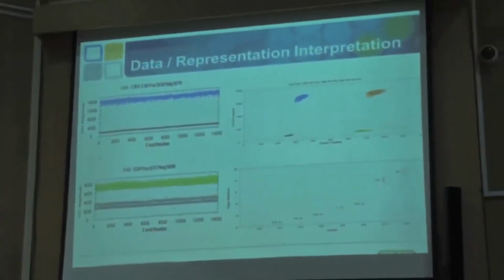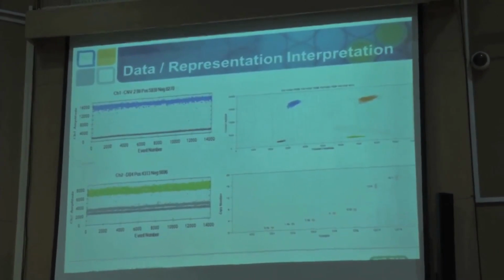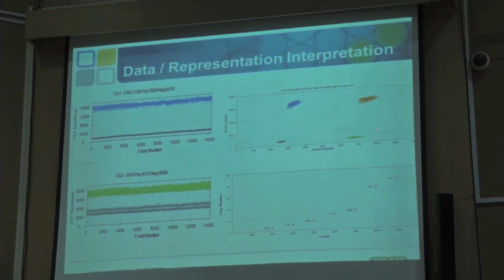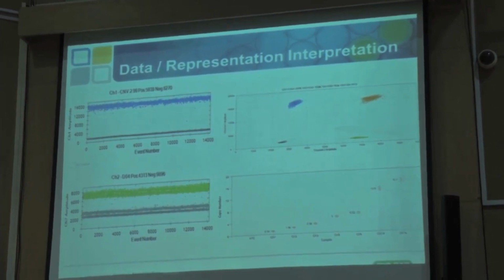Now this cluster which you see is from one type of amplicon. If another amplicon is smaller or bigger than that, that would give a different layer here. You can quantify each of these clusters individually. For example, in 2D you get it here, so you will have another cluster altogether. There are a lot of publications where people have gone up to 8 plex assays.